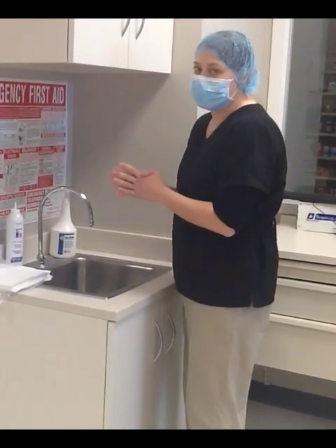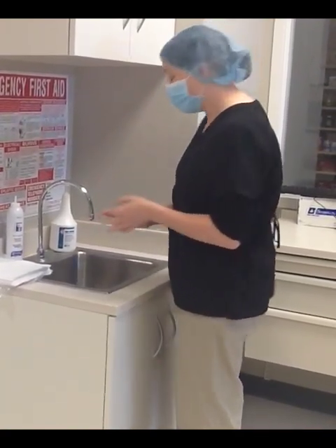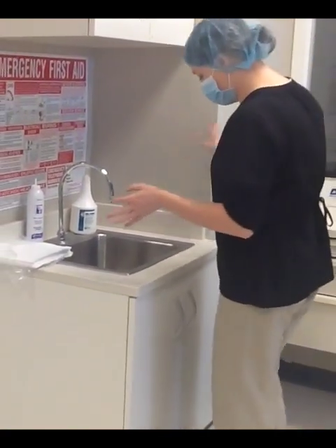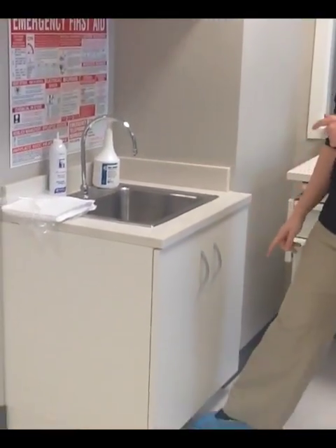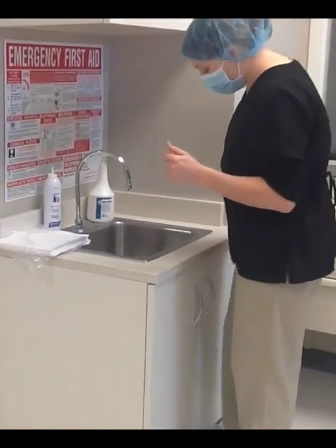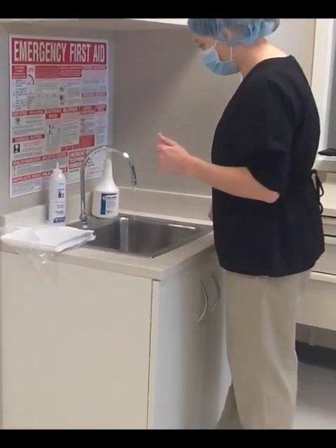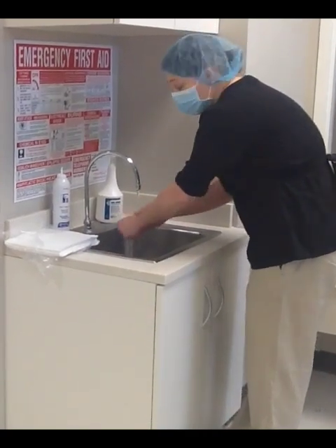We are at the hand washing station. I would like to go through how to properly wash your hands to get them ready for aseptic technique. This is pretty important. Your sink will usually have a foot or knee trigger for the water — here we have a foot trigger. Go ahead and trigger the water.